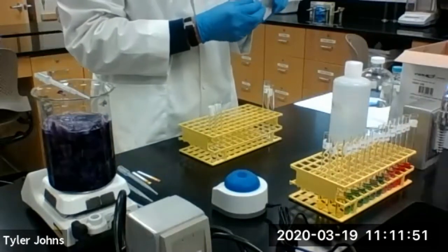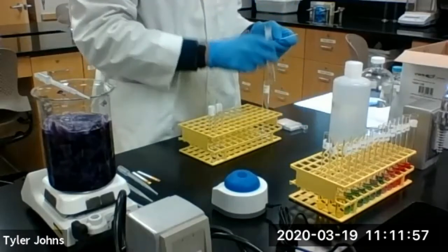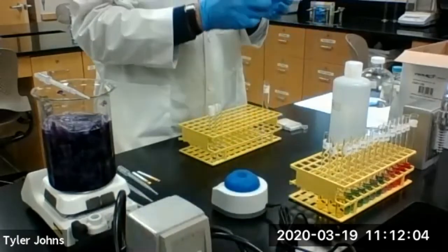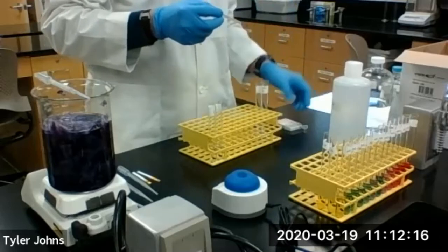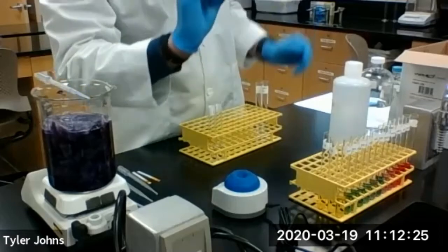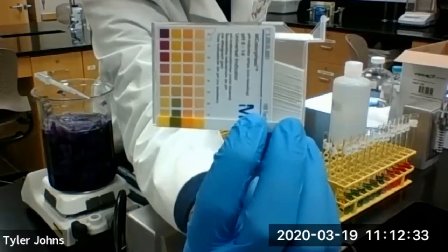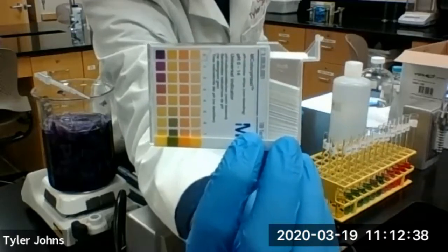Now let's check the pH of our pH 7 buffer with hydrochloric acid. So here's our pH 7 buffer, which we added the hydrochloric acid to. And here's the pH of our pH 7 buffer plus the hydrochloric acid, the same amount of hydrochloric acid that we added to the deionized water.